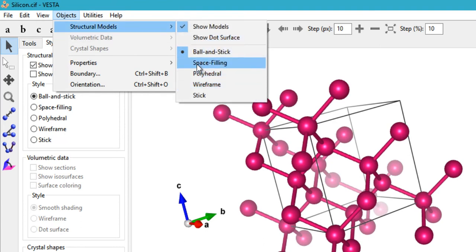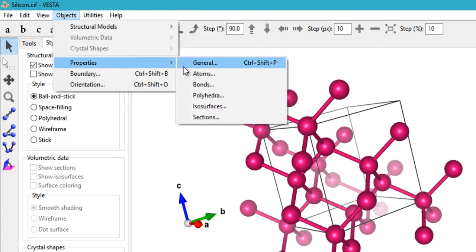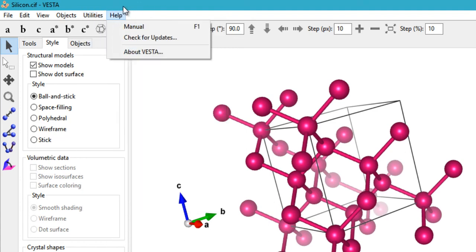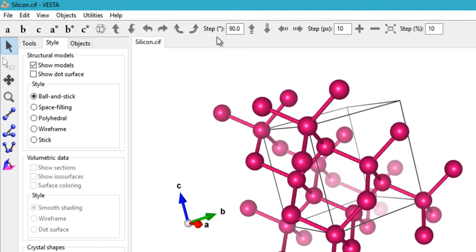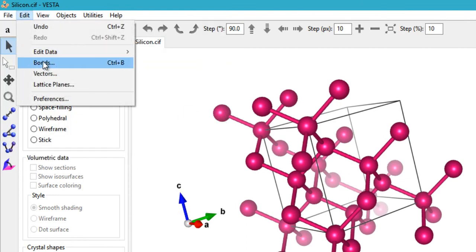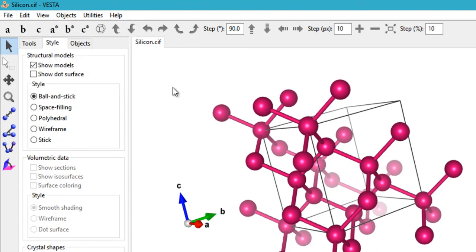Under Objects we have Structural Models and Properties, Boundary, and Orientation — all of which we have already covered. We have not yet covered Utilities, so that along with the Edit section will be covered in the next tutorial. That's what remains for future tutorials.